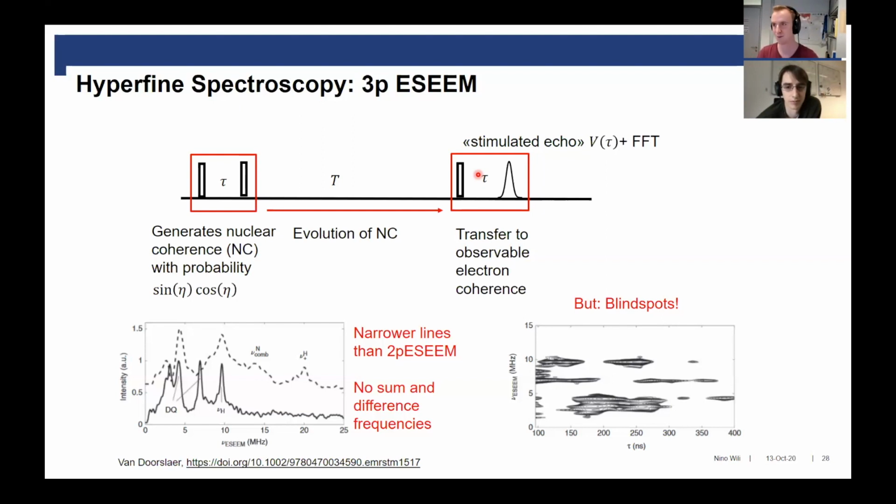From the very little experience that I have from my experiments, it's usually longer. And if you can do a proper T1 rho, it's much longer, but I cannot measure it as long as it is because our amplifiers can only give a certain length of pulses. But there are not really experiments that make use of this at the moment. Might change in the future.